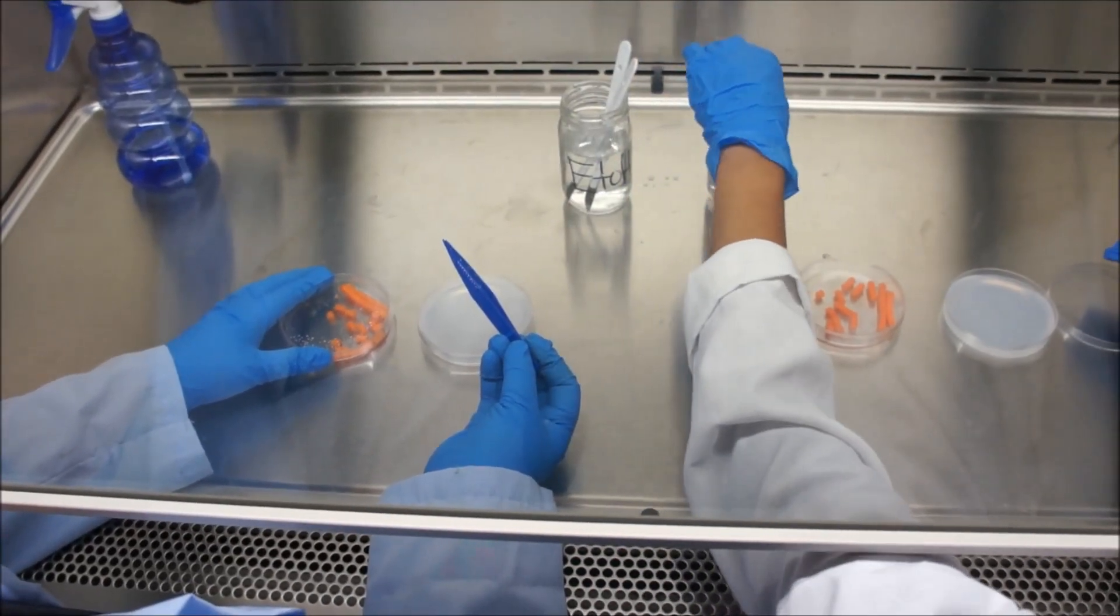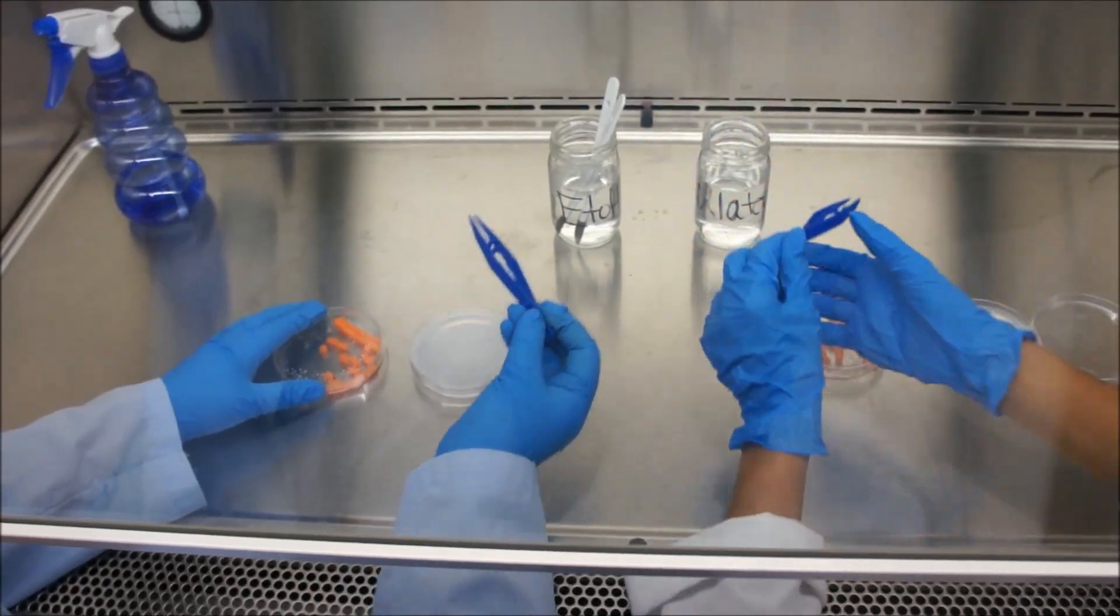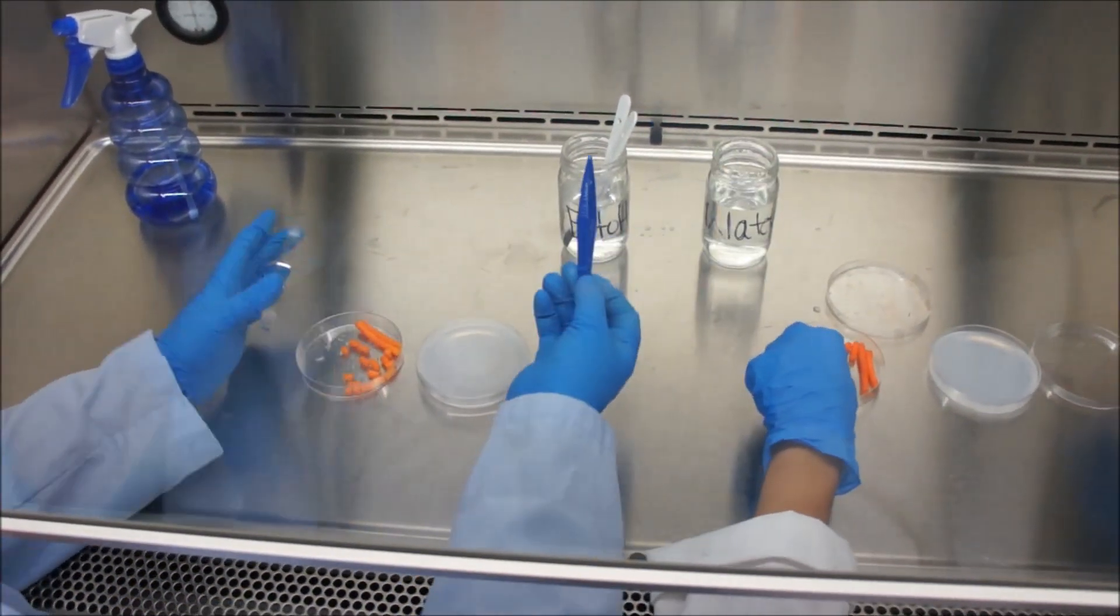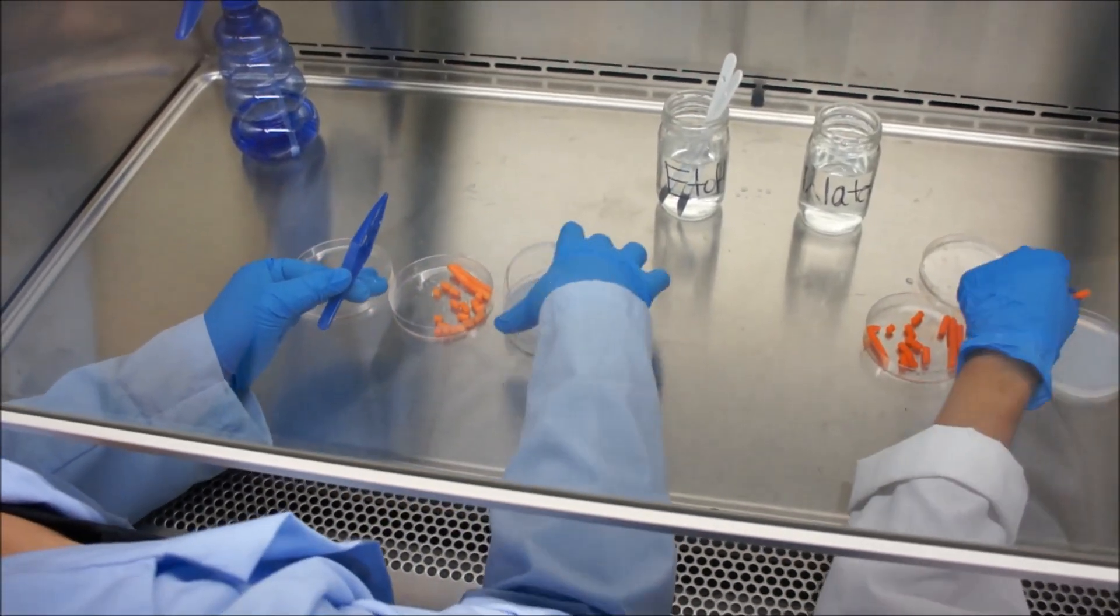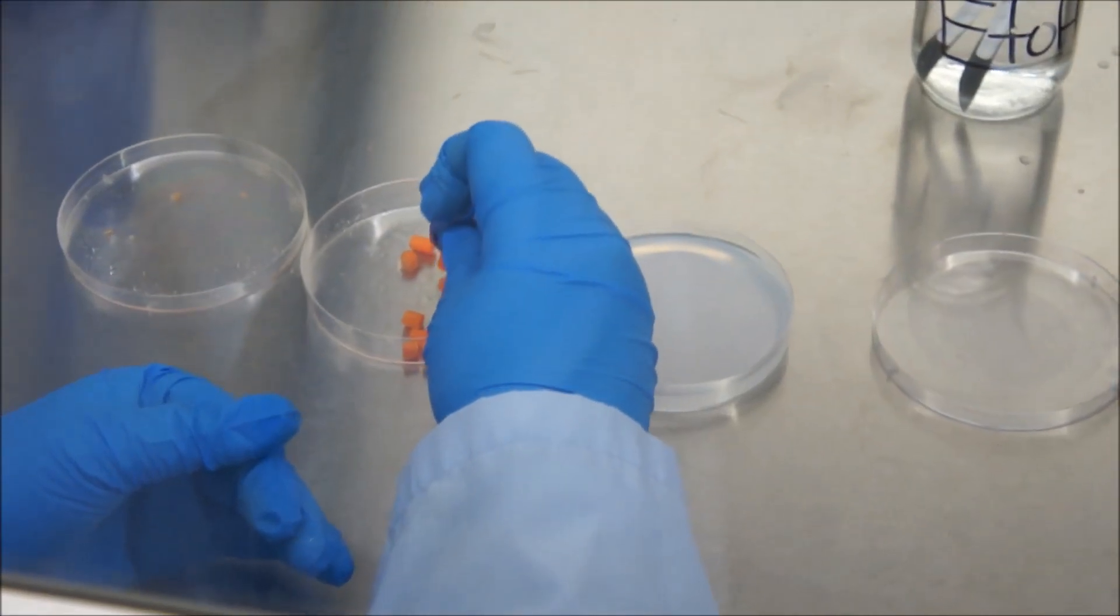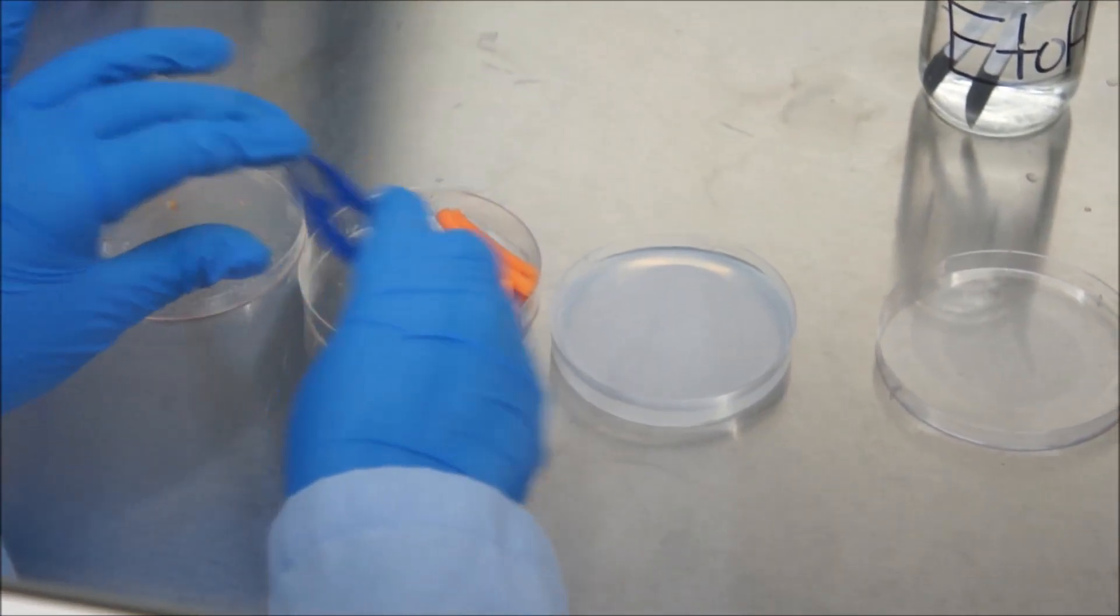Remove forceps from ethanol and shake into the tube with sterile water. Take a dish of callus initiation medium and carefully lift the lid. Using the forceps, lay the cross sections of the carrot core or carrot cylinders on the agar.